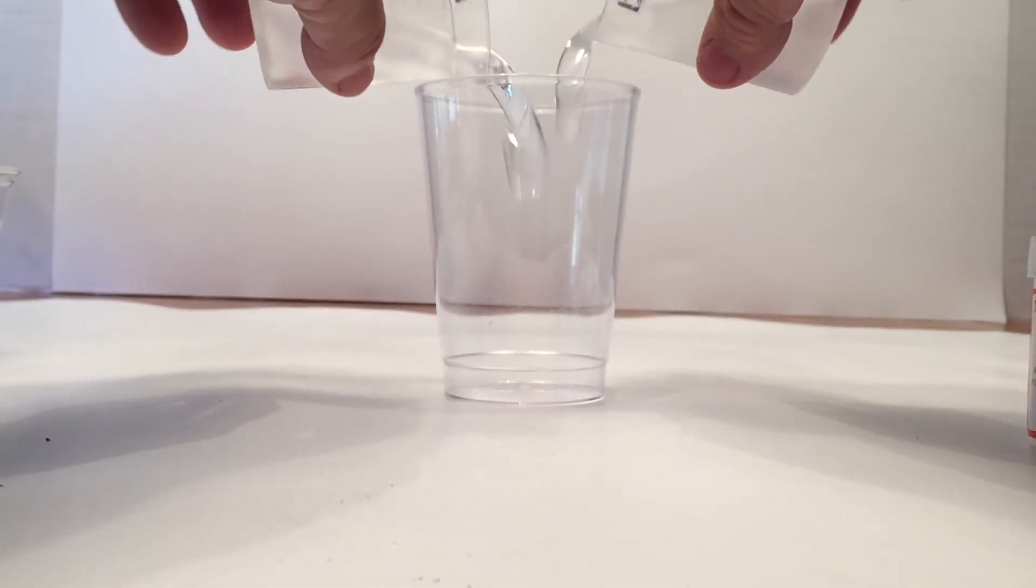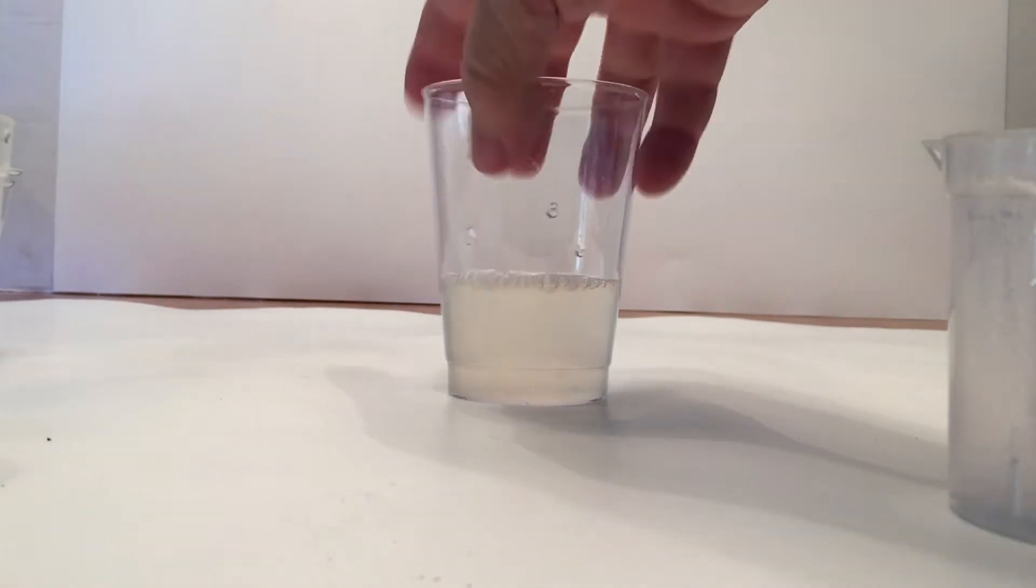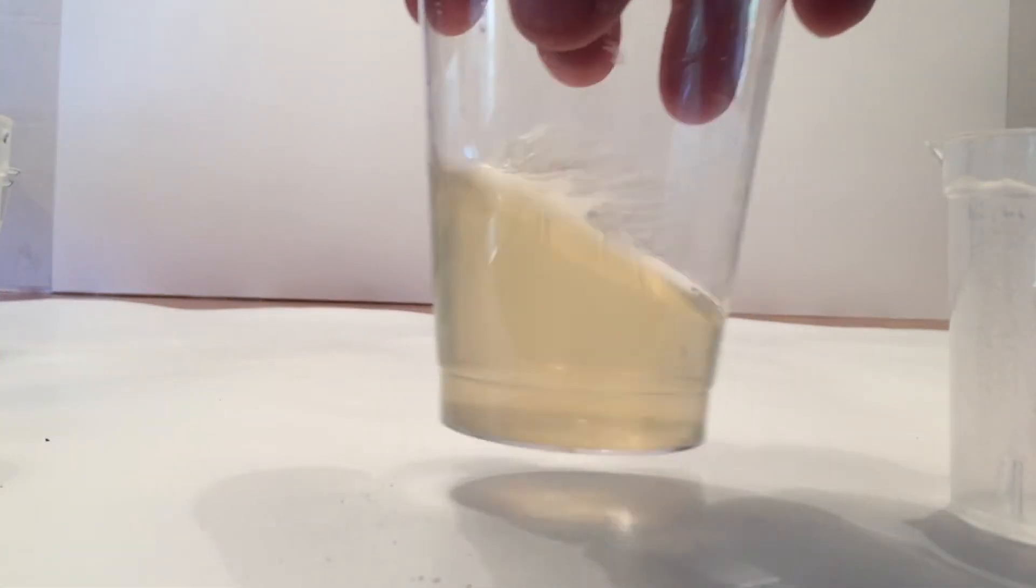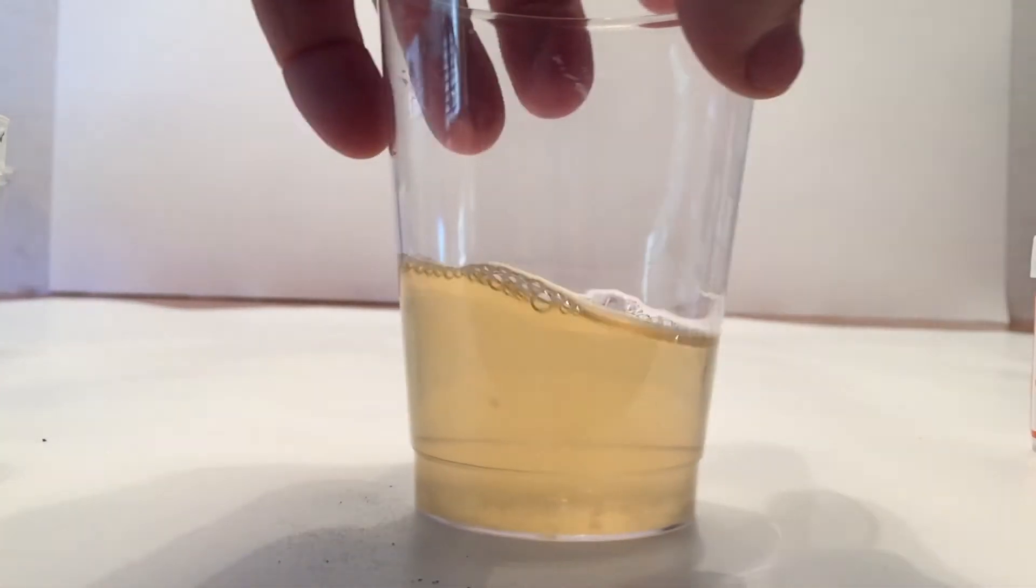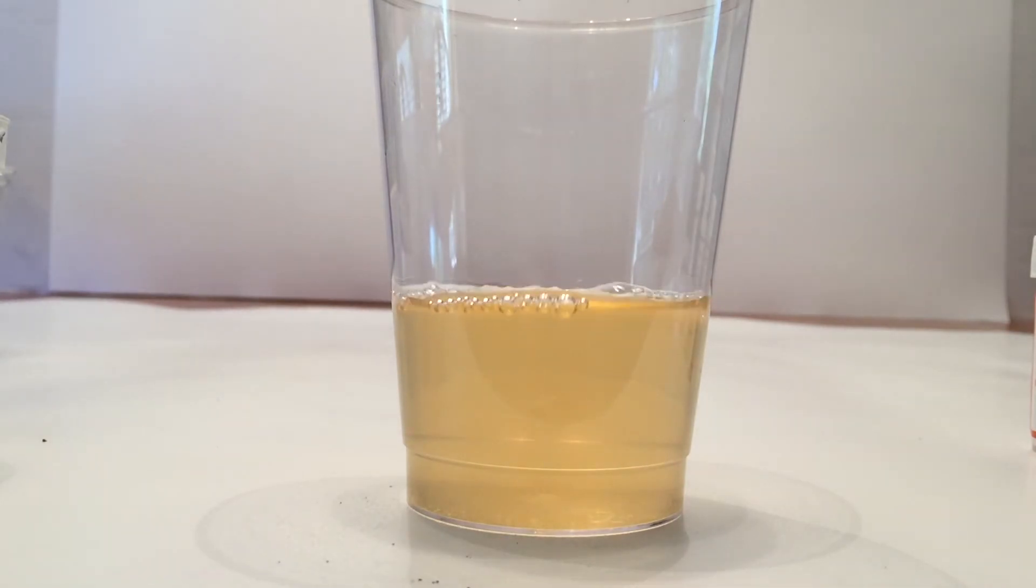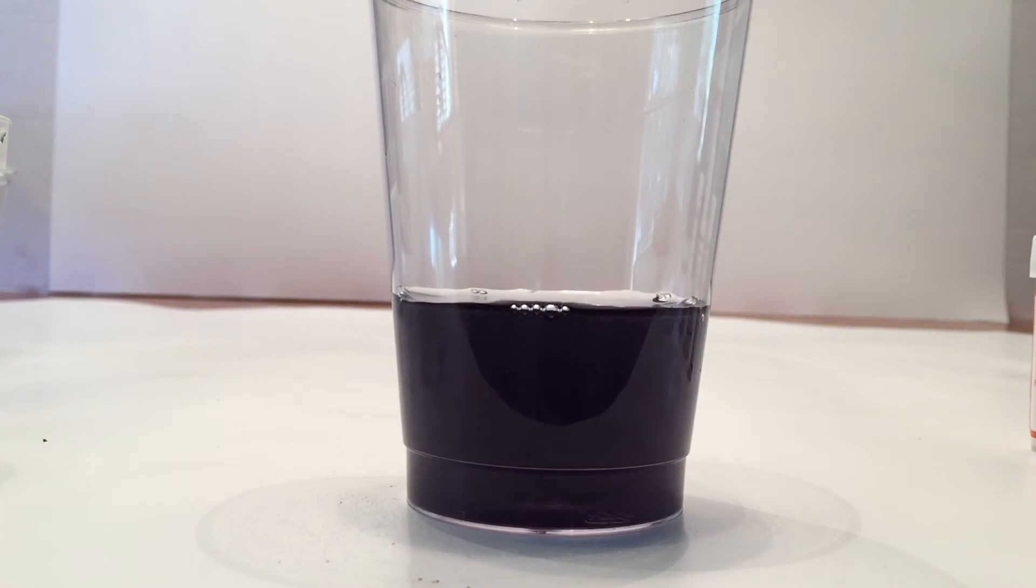So we take cup A and B at the same time and pour it into a third cup. And then it's going to do the reaction. So we'll go ahead and watch it. And we see what color it is. We all look like it's orange. Oh, it's purple.